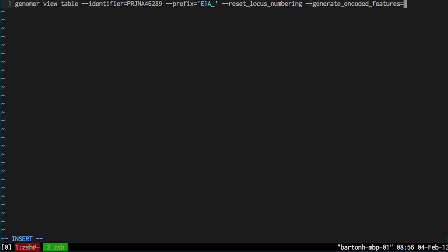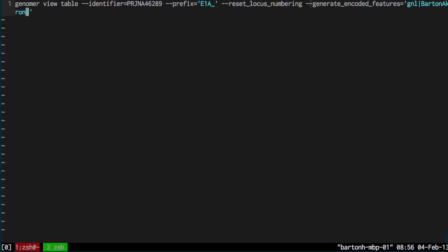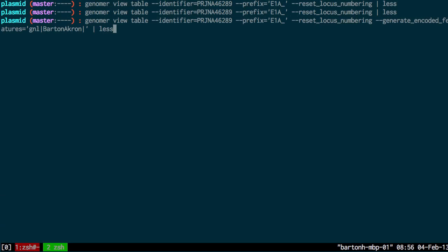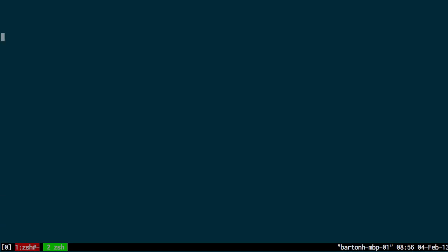And again you also need a unique prefix for these. For that I'm going to use gnl-barton-akron and this should be a unique identifier. Barton is the name of the lab and Akron is the name of the institution. That should generate the encoded features. What I'm doing here is just editing my command line in vim. That's why I keep switching to vim and then back out again to the command line.